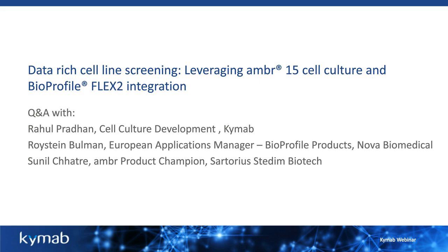So we have a question: with the FLEX2 having the gas module, do we still need to install the pH and gas on the ambr15 for pH offset? Sunil, are you able to comment on that? Yes, I can provide some comments as well.